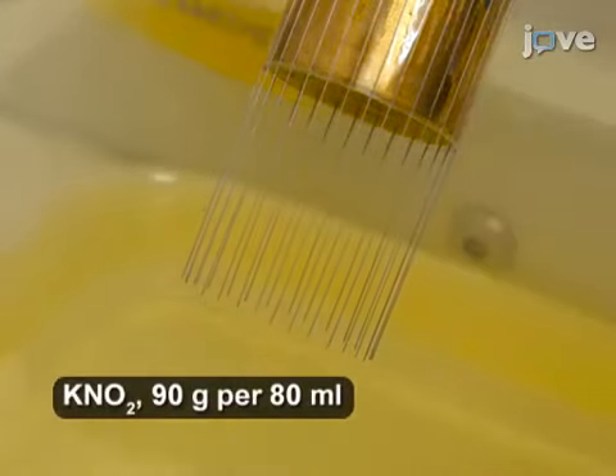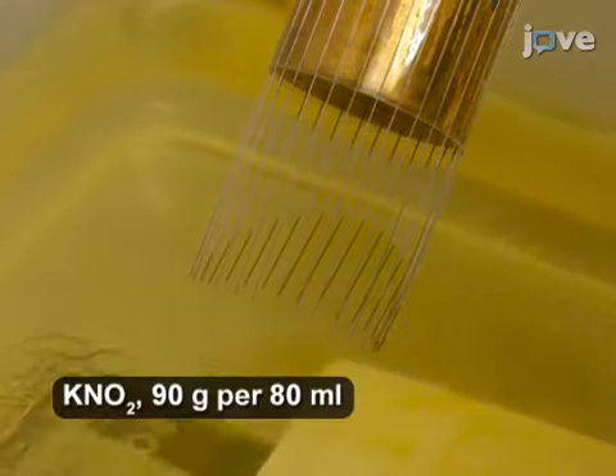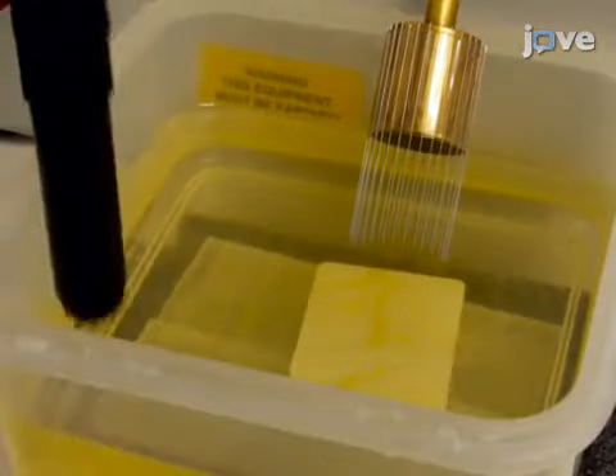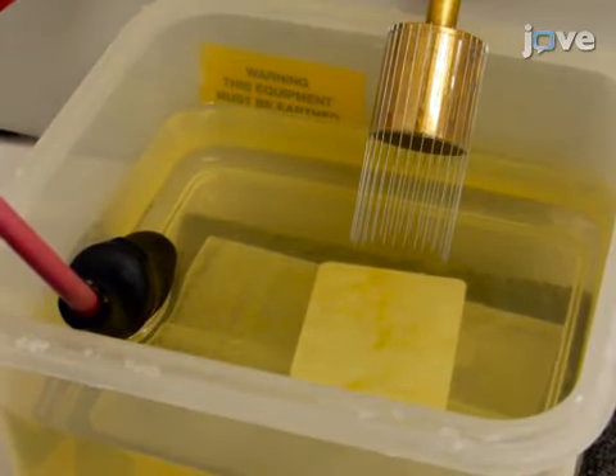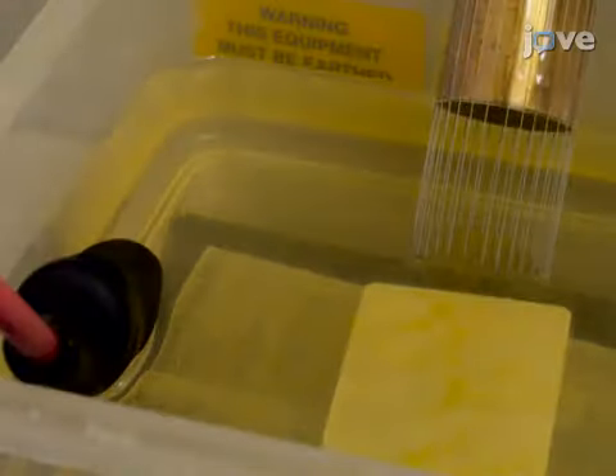Subsequently, immerse one-third of the wires in the solution. Next, immerse a carbon rod electrode into the etching bath to close the circuit. Turn on the workstation so the spindle starts to rotate.